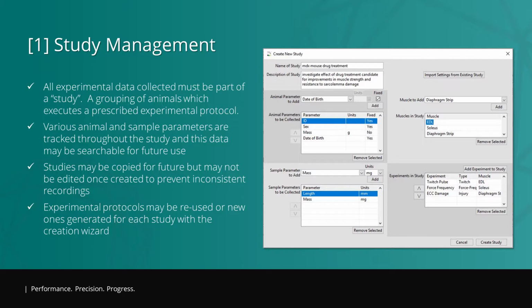I doubt it. But if we're able to have this data kept electronically and have a redundant copy that we know will be there and we know will be searchable, we feel that that is really a value add.